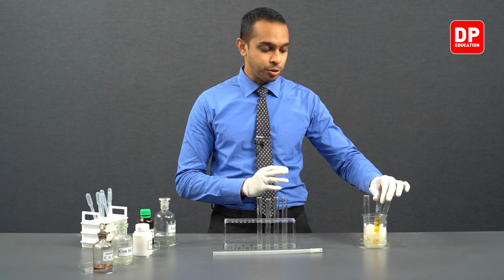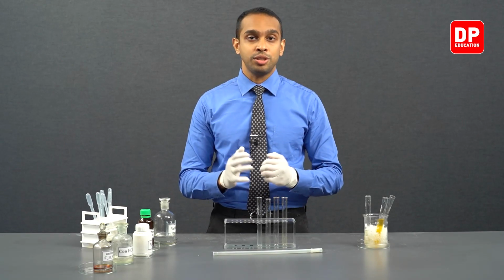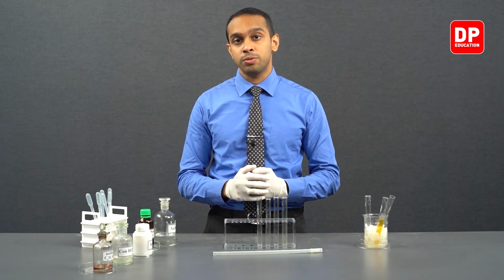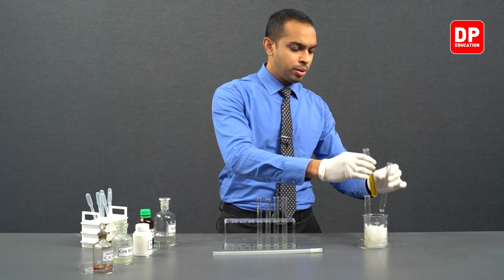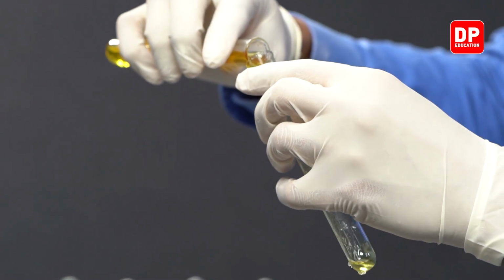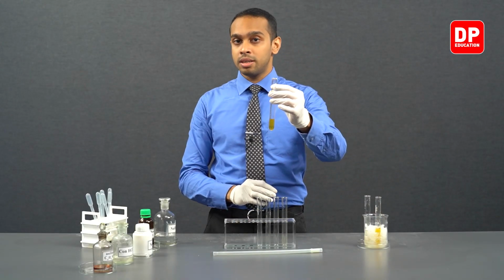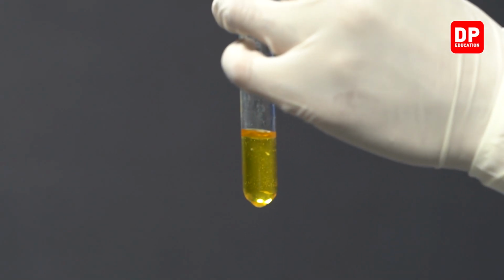And we have to make sure that we keep it in the ice bath as much as possible because this is stable under low temperatures. At high temperatures, this will turn into phenol, nitrogen, and HCl. So we'll take a portion of our benzene diazonium chloride into another test tube. And to this, let's add our alkaline phenol solution.